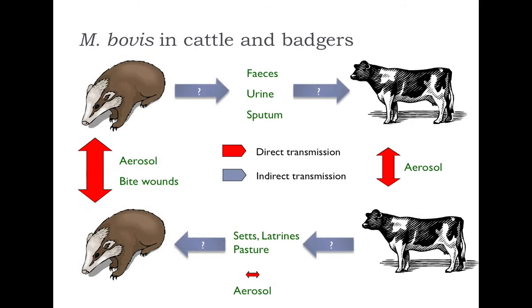I haven't said, and I haven't put it on a slide, but we've actually continued this work, and we've now got over 500-fold coverage of the genomes from that particular sample, and we're doing 24 more samples right now, in fact, in the next week or two, and hopefully we'll be able to start to actually reconstruct the spread of tuberculosis in that 18th century Hungarian population.